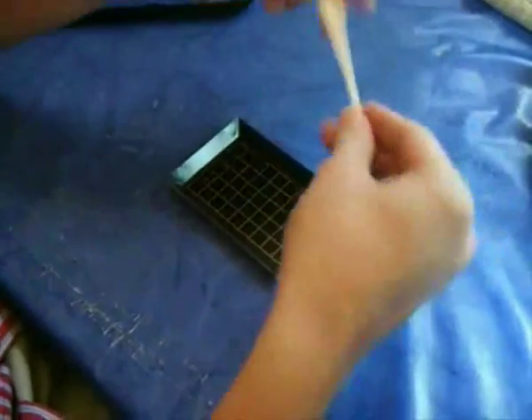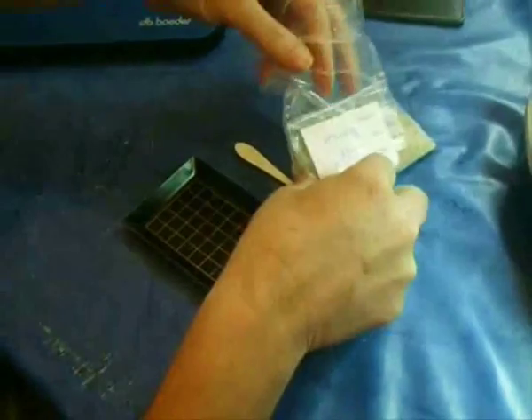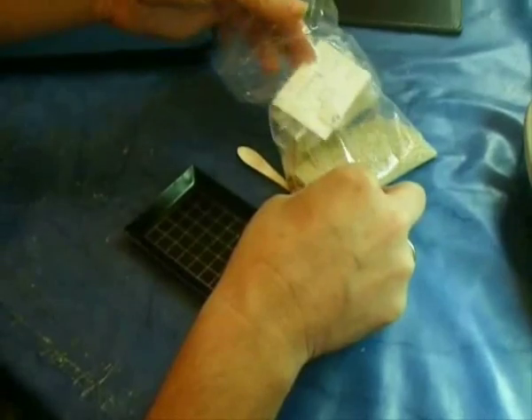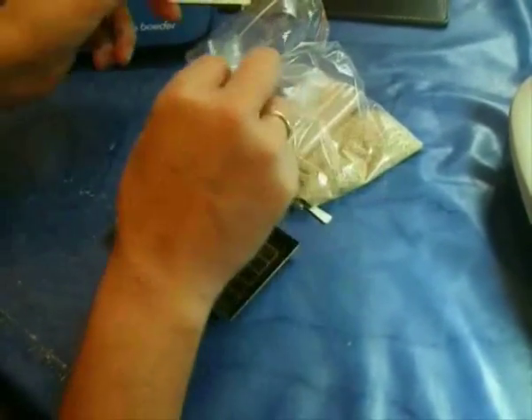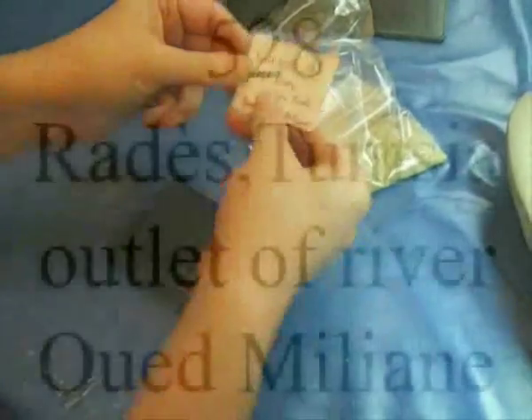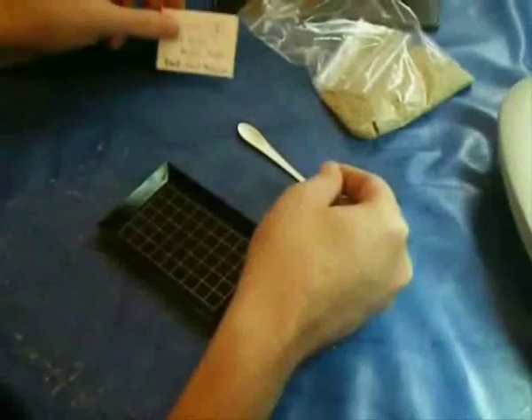Now the tray is cleaned, and of course we need a spoon to disperse our material. It is a sample sent to me from Tunisia, and the first thing you do is note where it is coming from. As you can see, it is from Rades in Tunisia, from an outlet of the river Medjerda near Tunis.